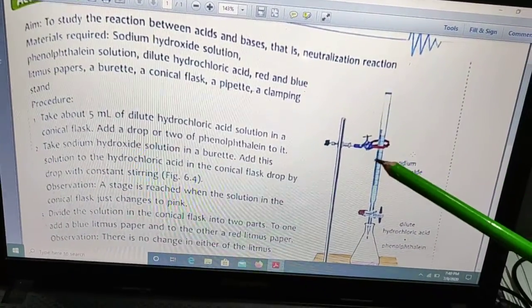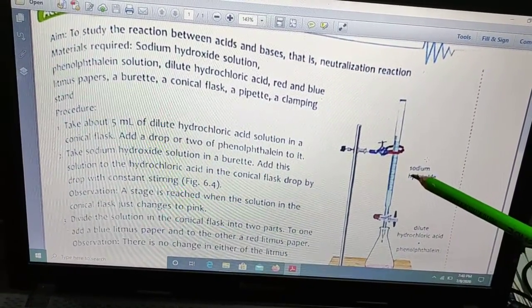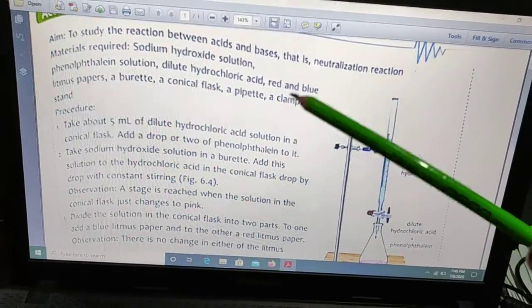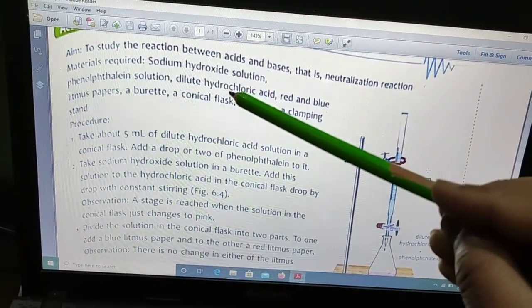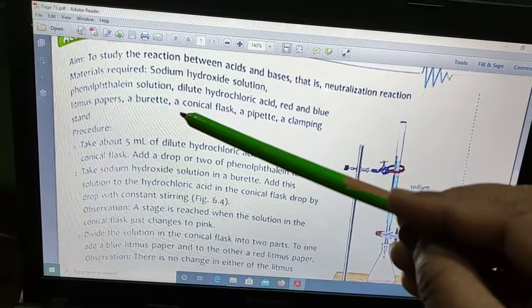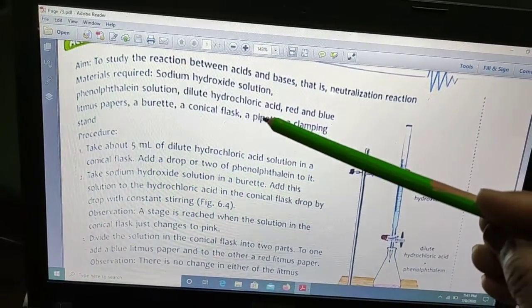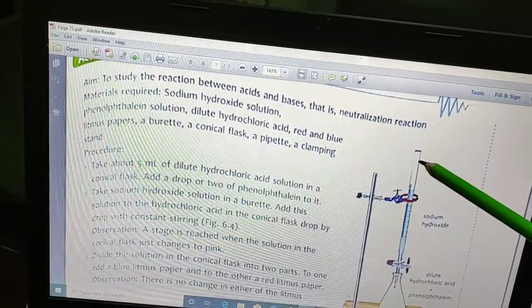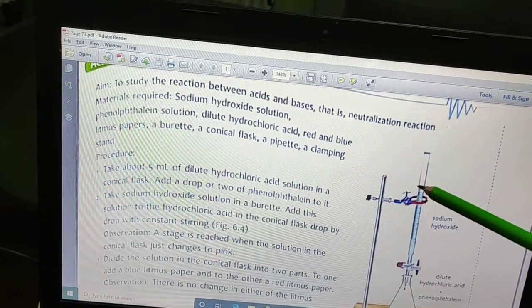In this it has been shown how neutralization reaction takes place. For example, the materials required in this case are sodium hydroxide solution which is a base, phenolphthalein solution which is an indicator that shows change in color in different solutions, dilute hydrochloric acid, then we have red and blue litmus paper, a burette, a conical flask, a pipette, and a clamping stand.